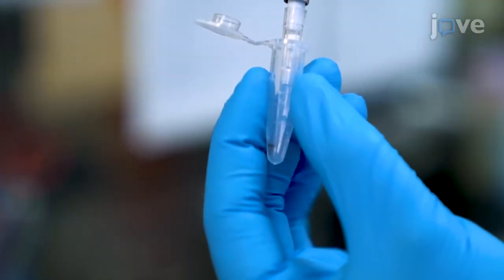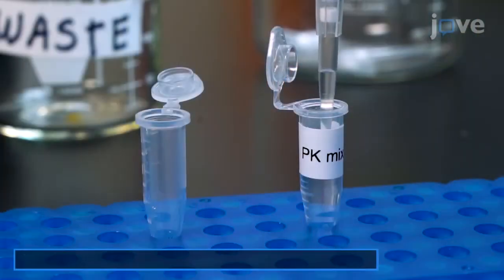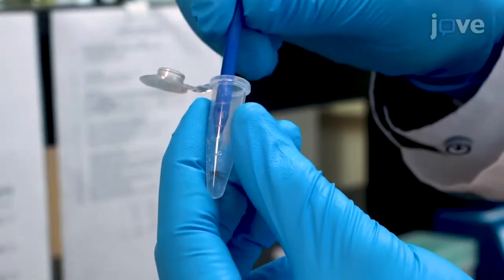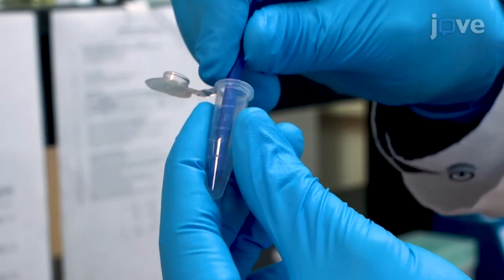After the incubation, discard the water and add 100 microliters of proteinase K buffer enzyme mix. Then use a microcentrifuge tube pestle to homogenize the tissue.